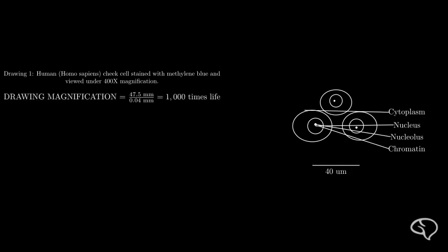The drawing also includes a calculation for the drawing magnification. This is the ratio of the size of your drawing to the actual size of the object. It's a good practice to include this calculation to show the scale of your work.